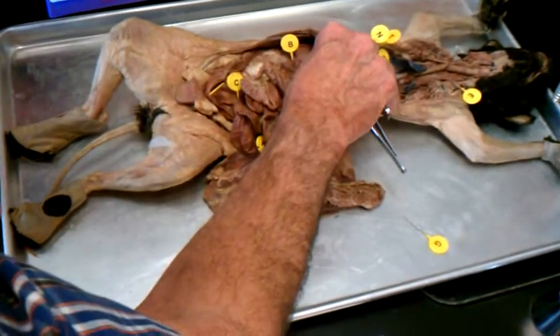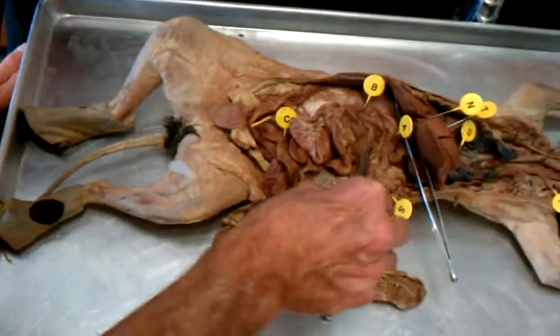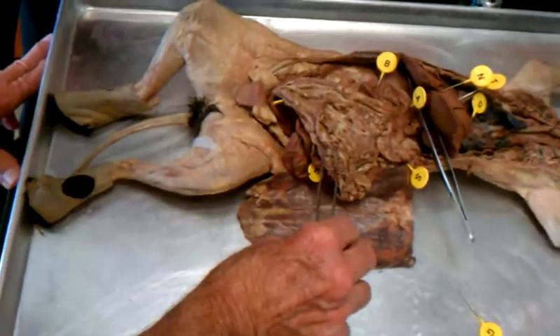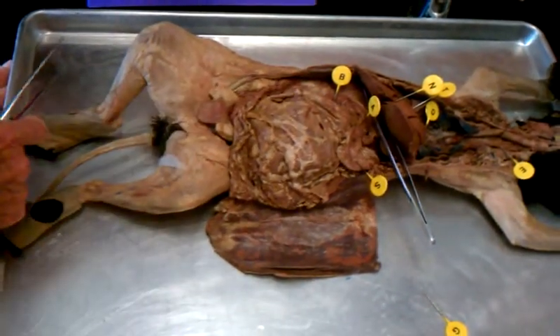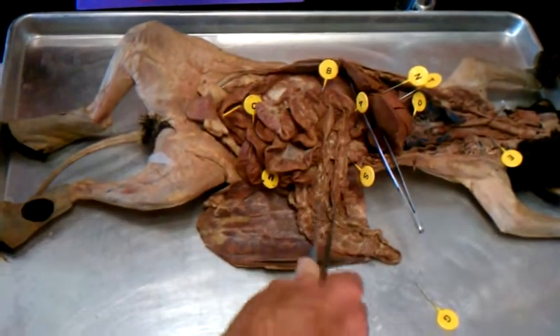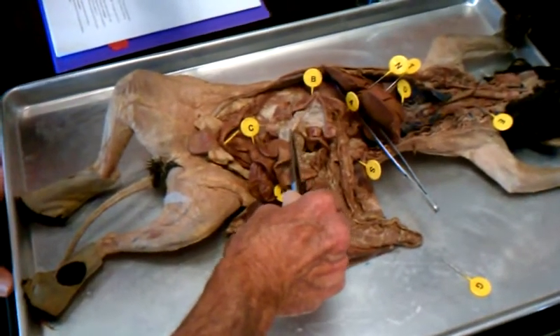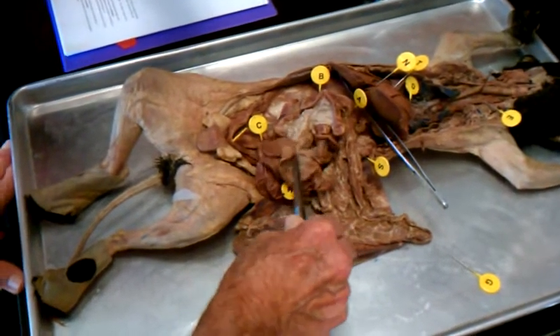The small intestine winds around and winds around. It is normally covered by this sheet of membrane, and this is the greater omentum that covers the small intestine like that. But we'll peel it back away so we can see. And the small intestines are held in place by a series of membranes that suspend the small intestine in the abdominal cavity, and that is the mesentery. All of these are referred to as the mesenteries of the small intestine.